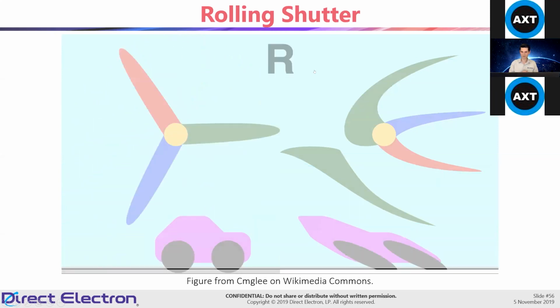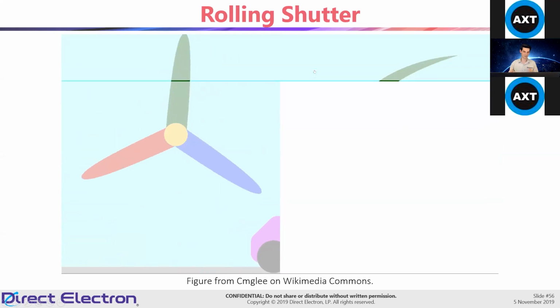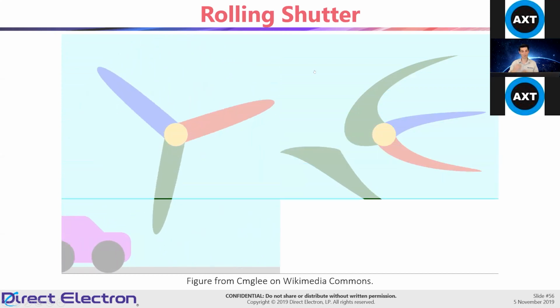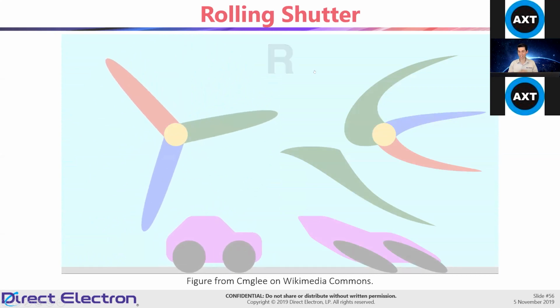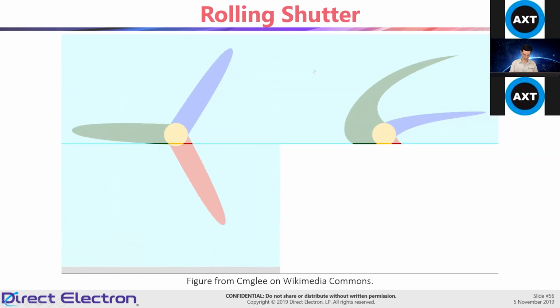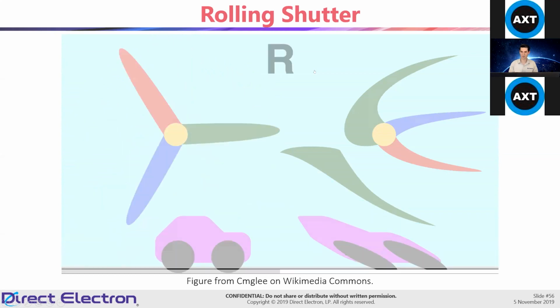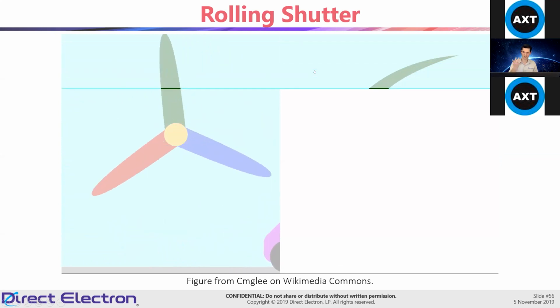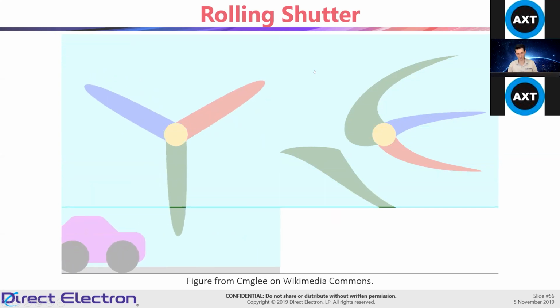So the 2 benefits for this is that you can synchronize with a diffraction pattern. But mainly for something like material science, you can synchronize with the scan. And so that's the benefit of a global shutter: if you have a diffraction pattern that's moving and changing as you're doing this continuous tilt, then with the global shutter, you can capture exactly all the intensities from that position all at the same time without any streaking artifacts from one frame to the next.